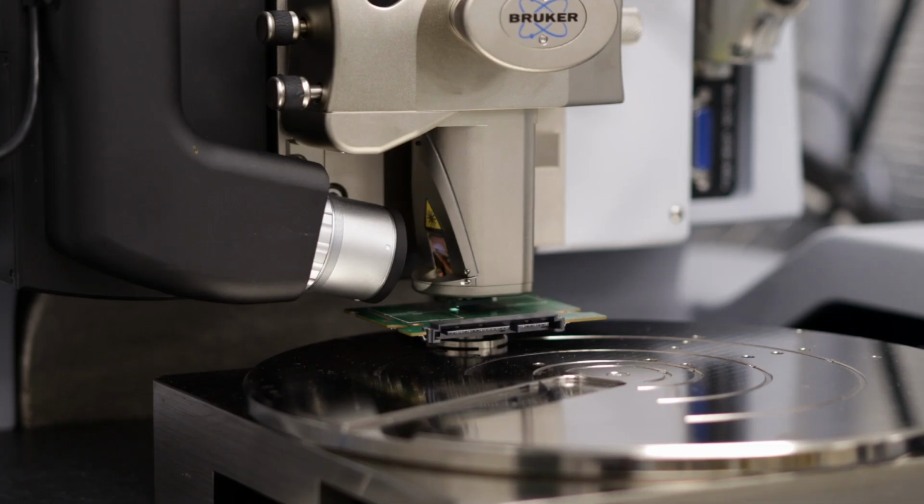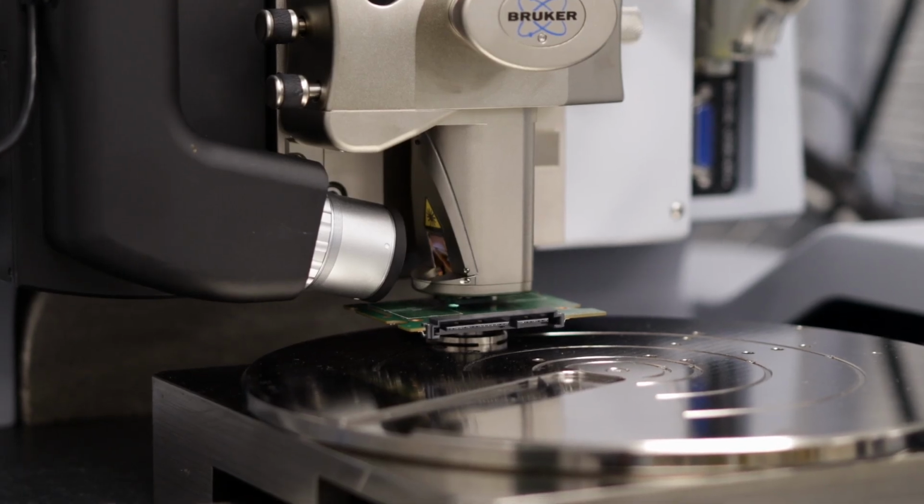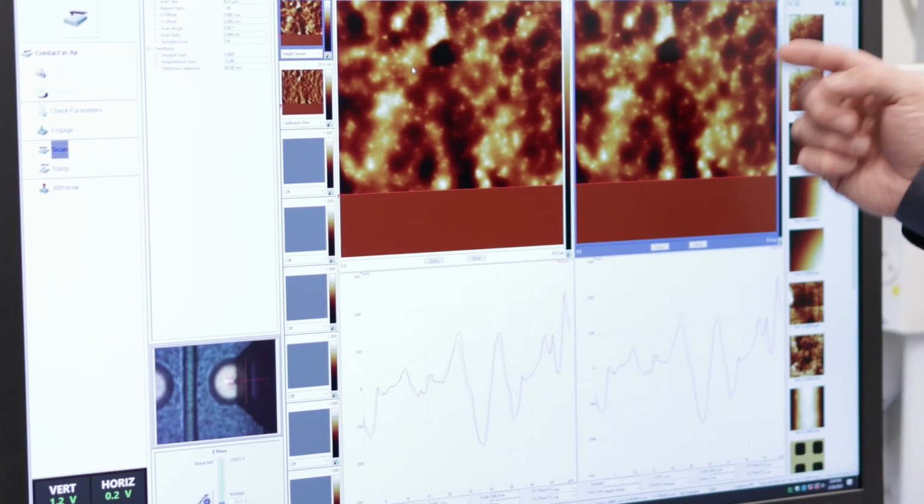By allowing our students to learn these techniques and allowing our students to understand what it takes to measure and characterize items on the nano level, this gives them the skill sets required so that they can go in and become process engineers, quality engineers, and product improvement engineers as they're assessing the capability and quality of the products and the process itself. We're currently using this in our Manufacturing Processes 2 course, so it is an elective course, but in the future we hope to move this into our required undergraduate IE 370 Manufacturing and Processes 1 course, where all of our undergraduate students will have access to this microscope and understand what it takes to measure things on the nano level and understand what it would require to be a quality and process engineer for the microchip manufacturing industry.